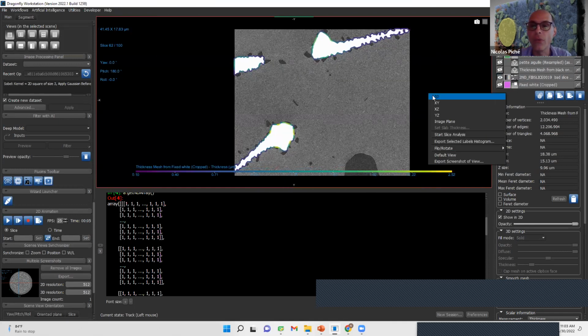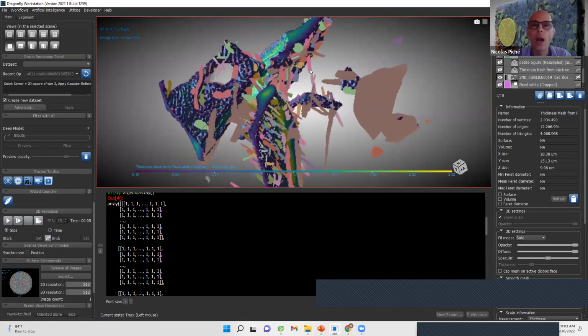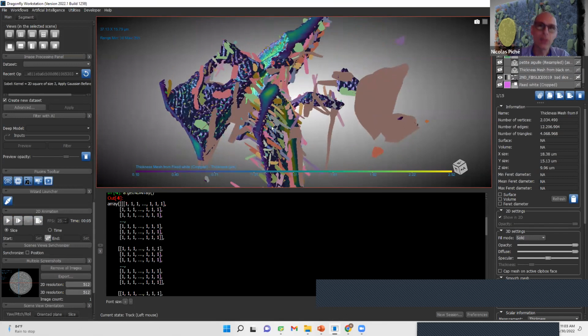It's an old data set, but now you can combine all those renderings and see where are the spikes that touch the surface, those that are not, what are the preferred orientations of those that touch the surface or the other ones, and all that, to classify your blobs or whatever it is. Okay, so tomorrow I will show you how to play with the object analysis, which is our classifier of feature vectors of multi-ROI, and I gave you a preview.